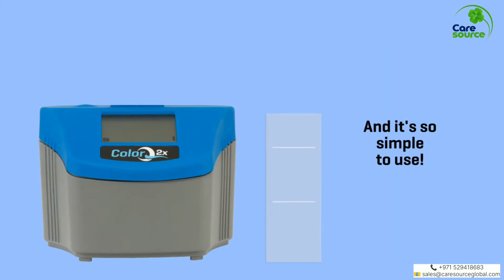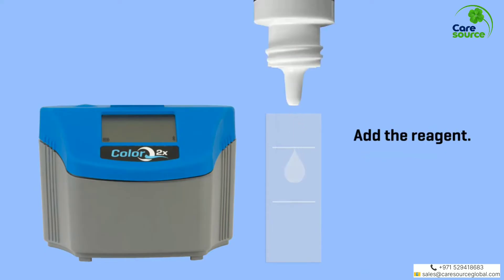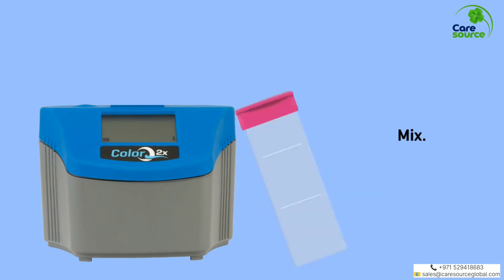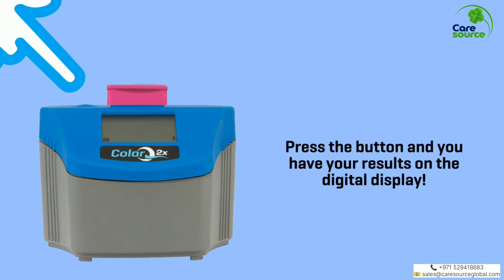And it's so simple to use. Fill a tube with your water sample. Add the reagent, then add a color-coded cap. Mix, then insert the tube into the photometer. Press the button and you have your results on the digital display.